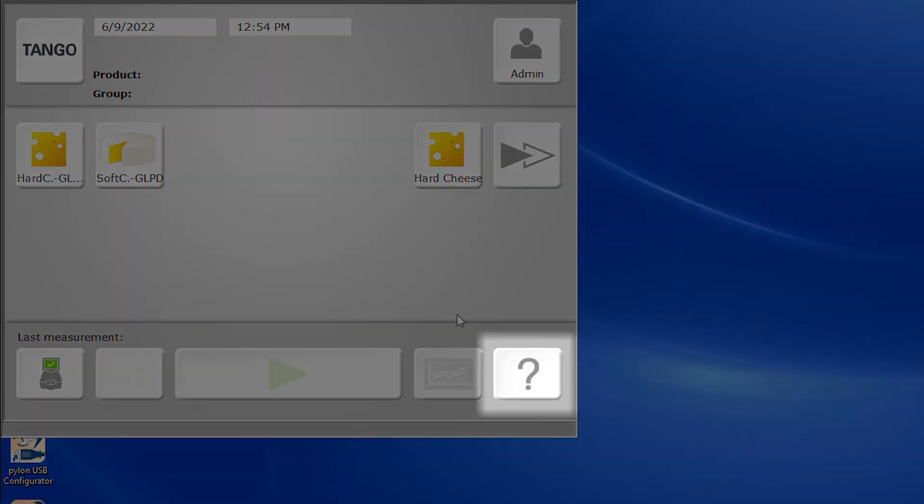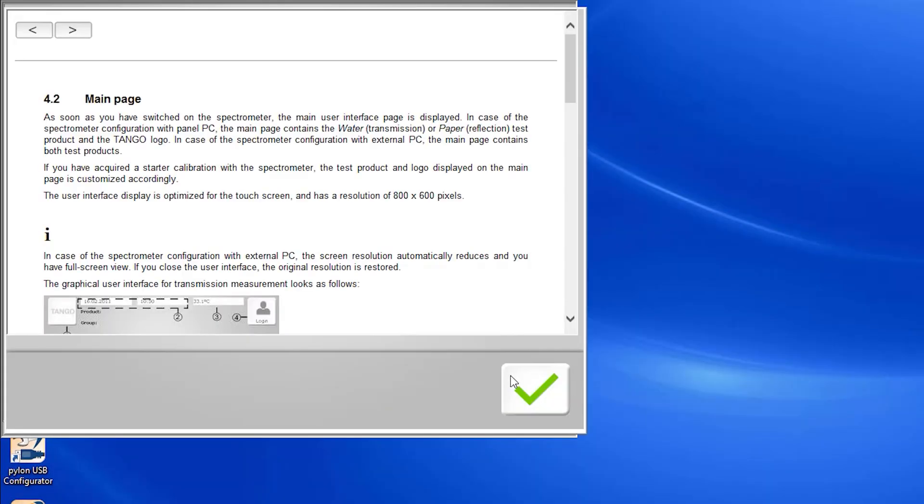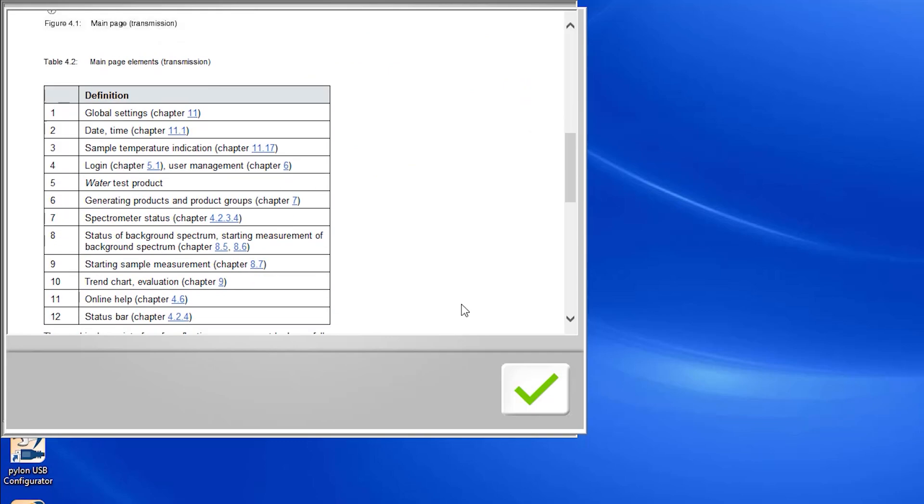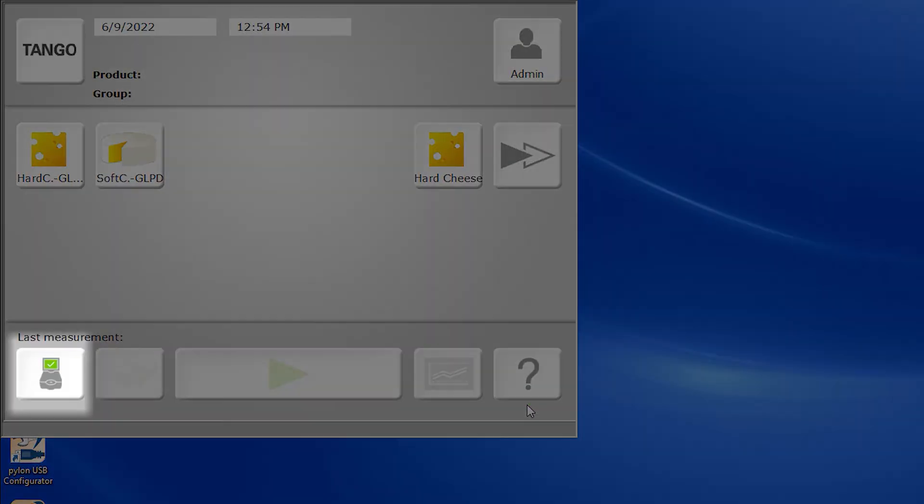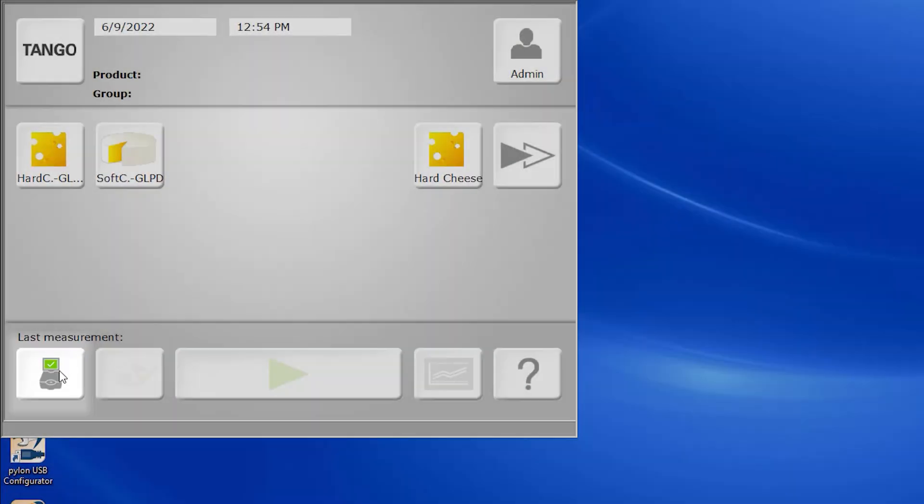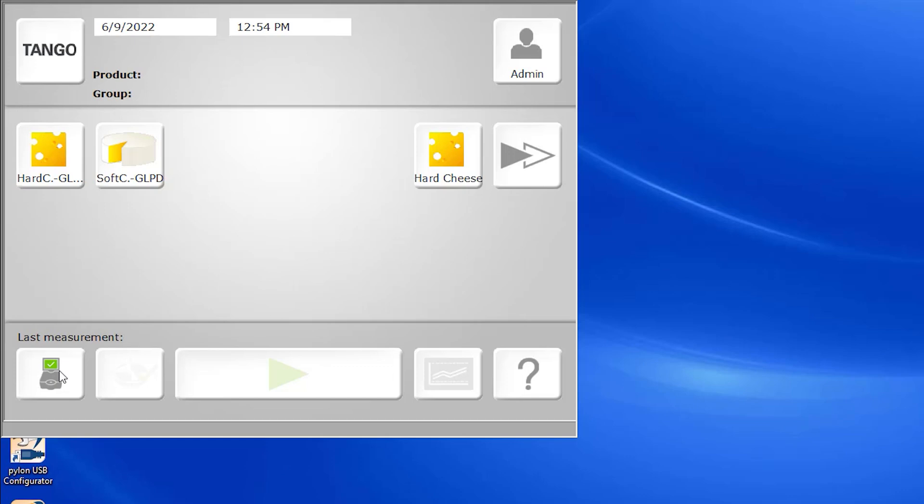In the lower right hand corner, we have our help menu, which allows you full electronic access to your Tango manual. In the lower left hand corner, you'll see an icon representative of the Tango instrument and indicators of the instrument's diagnostic health.